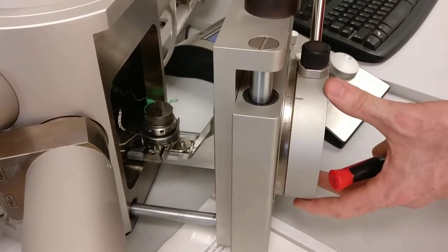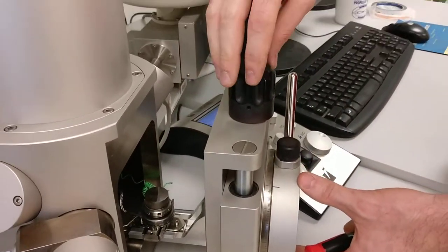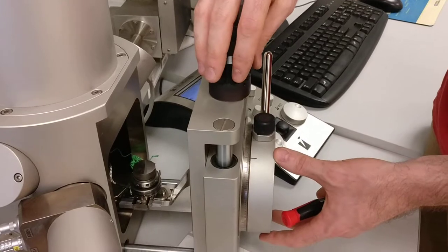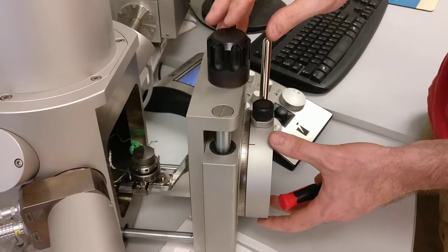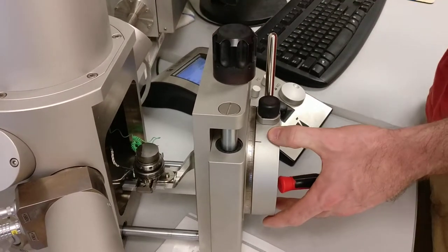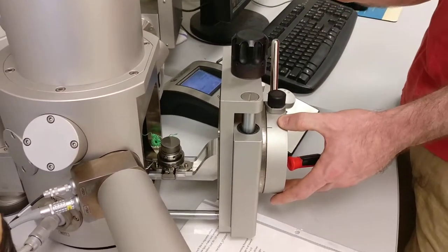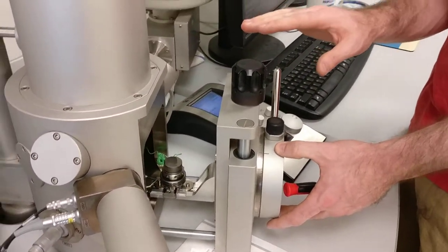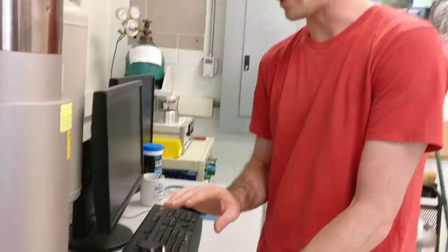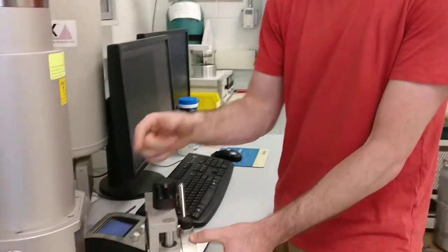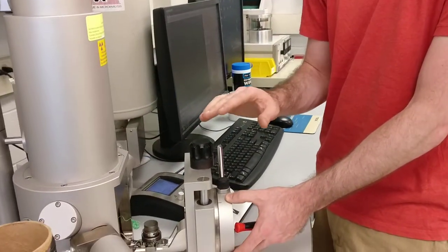Then make sure that this is screwed in clockwise all the way. If you have samples that are taller than an inch and a quarter, they won't fit in here, and you may hit the bottom of the pole piece, which would be bad.